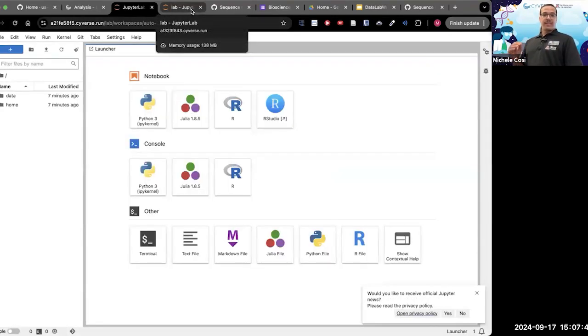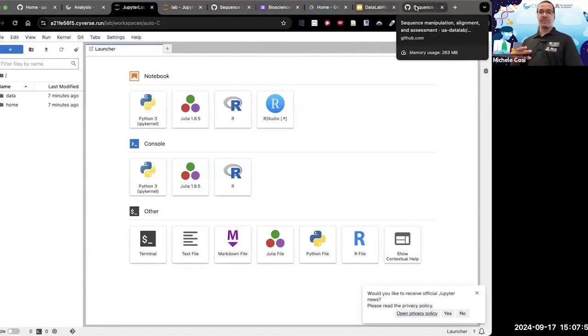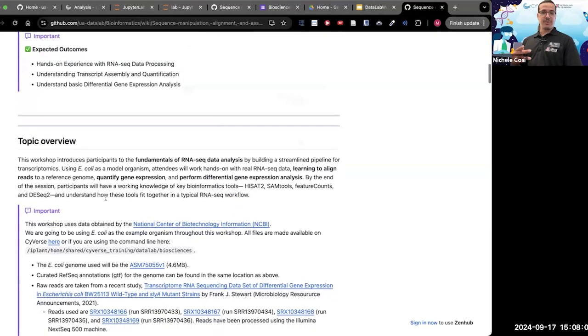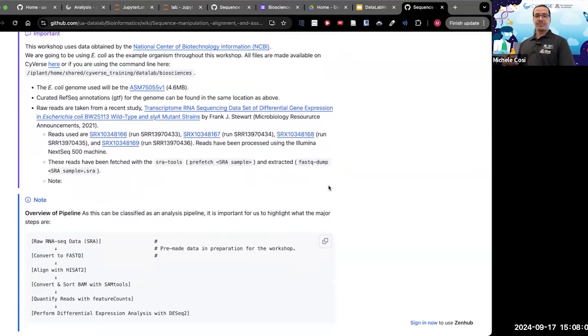Okay, so before getting into the themes of the day, we need to get data. Data is important for today, and we need to do a couple of things to get the data. Going back to today's lecture, if I scroll down over here, we have the explanation of the data that we're going to be using.